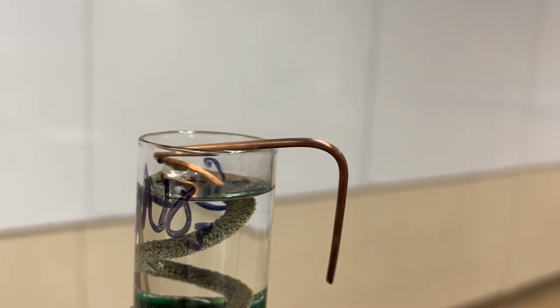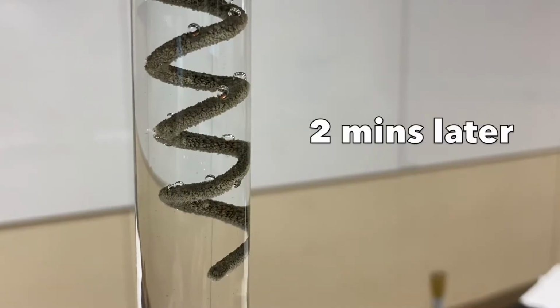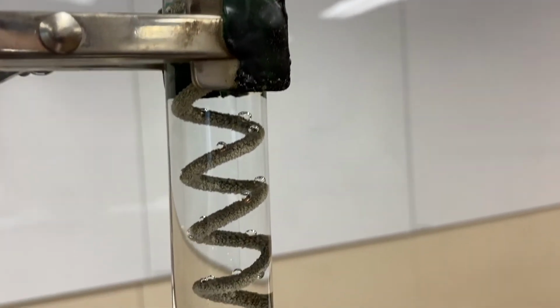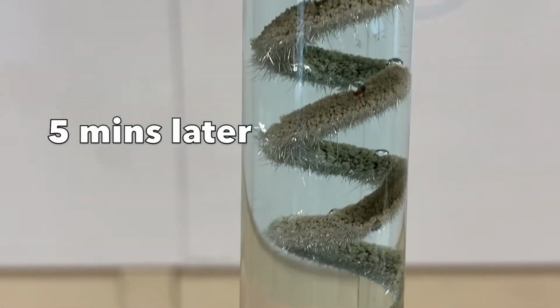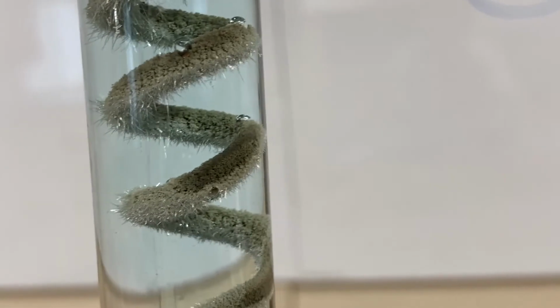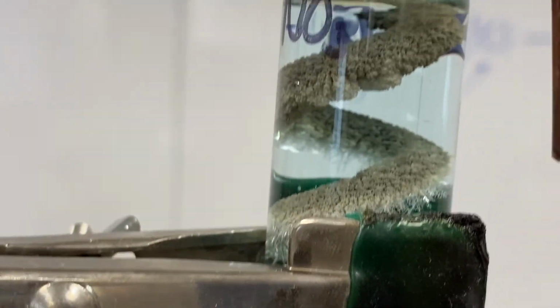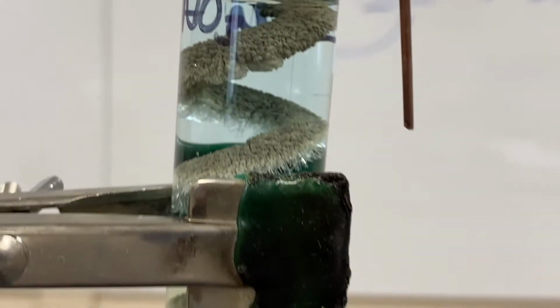So it started out looking like that copper wire, and now it's almost fuzzy. Okay, so about 5 minutes have gone by since I filmed last, and look at what this beautiful thing looks like. There are crystals everywhere. It's fabulous. Chemistry is so cool. And mind you, this whole giant fuzzy thing all started out as that clear, thin wire. And now it looks like this.